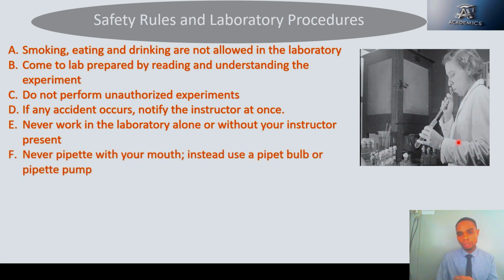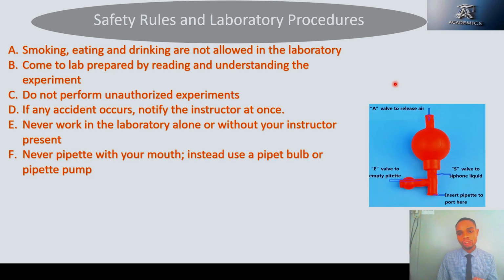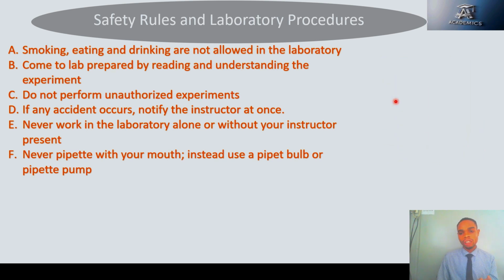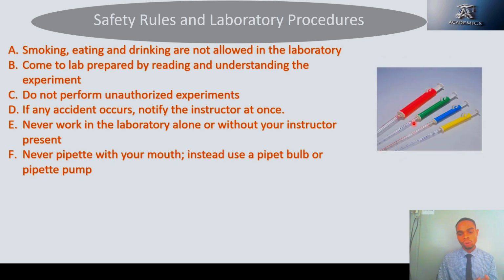Whenever you pipette with your mouth, you can mistakenly take in the chemicals, and this can lead to damage of your internal organs. So instead use a pipette filler to draw in your liquid, or a pipette bulb, something like this, to draw in your liquid. Never use a pipette with your mouth. You understand? So as to avoid any hazard.